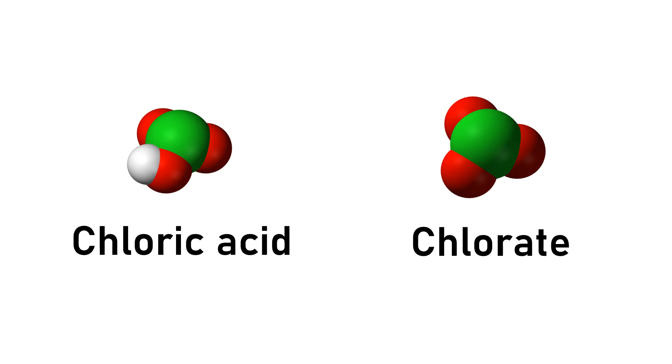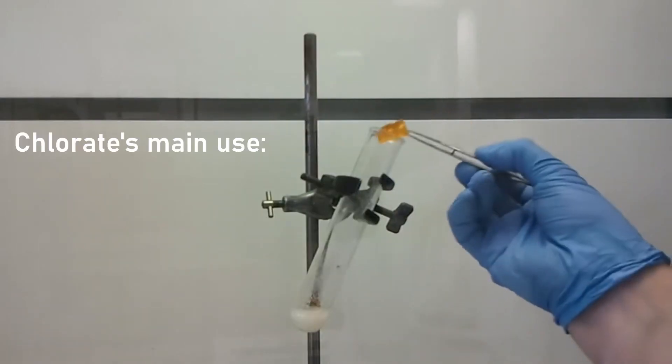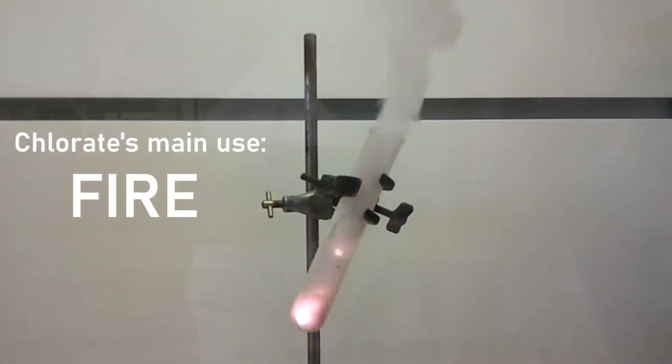To get chloric acid, we first need a chlorate compound. Chlorates don't have a whole lot of uses, and they aren't super accessible unless you have an electrolysis cell, or like me, a whole bunch of matches.